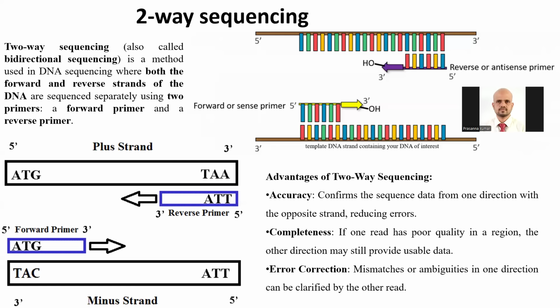Meaning, when you are done with your PCR, the PCR amplicons are split into two samples, and they are again subjected to single-strand amplification. Either the forward strand or the reverse strand is amplified separately. Again, both samples are injected into the sequencer.